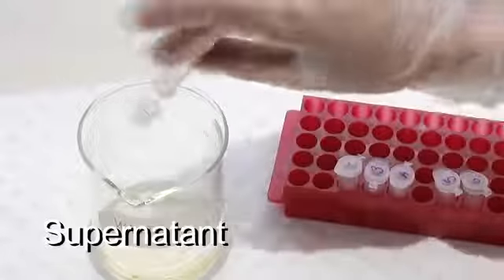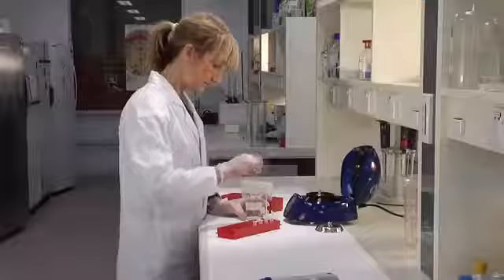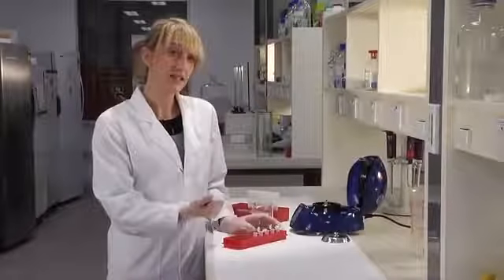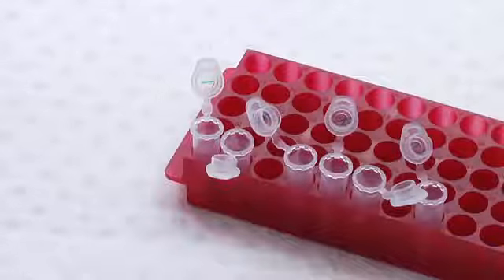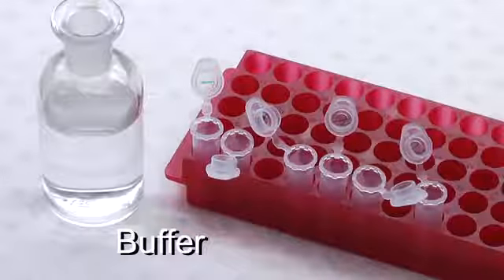Once the plasmid's precipitated, we can throw away the supernatant. And then, because ethanol can interfere with later steps, we'll just leave them to dry. Once the pellets are dry, we resuspend our purified plasmid in a small volume of buffer.